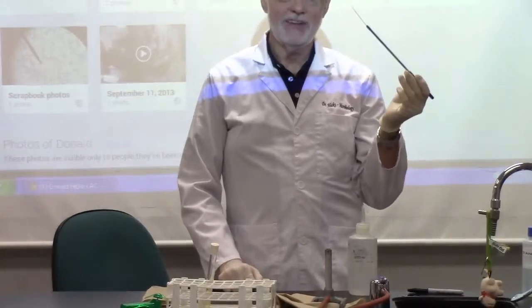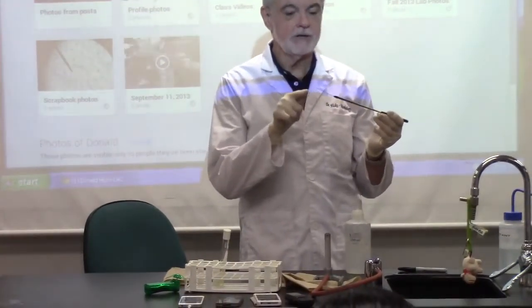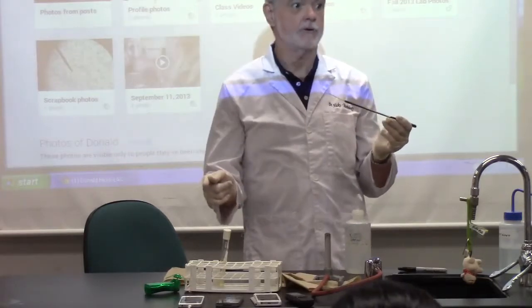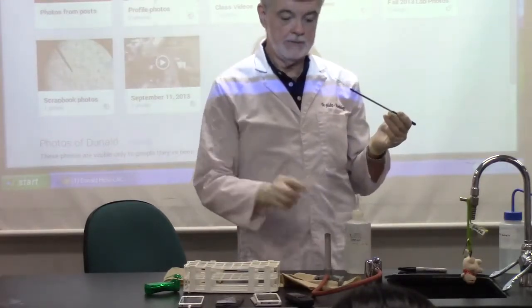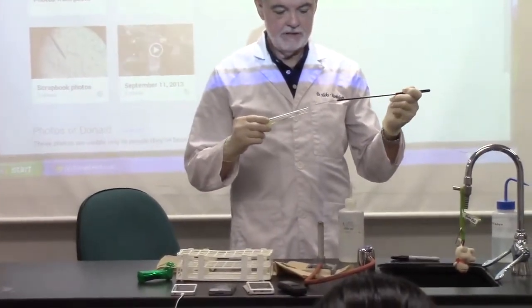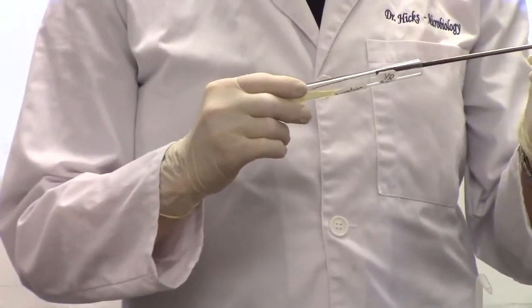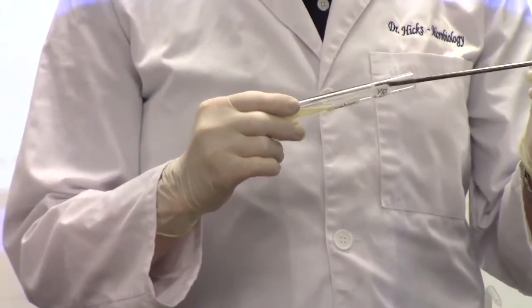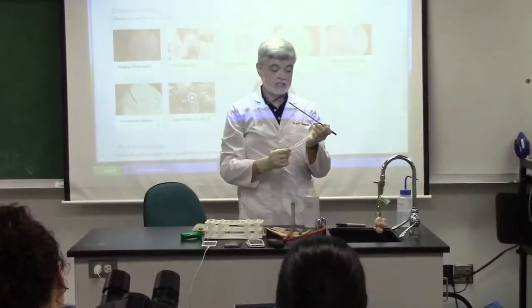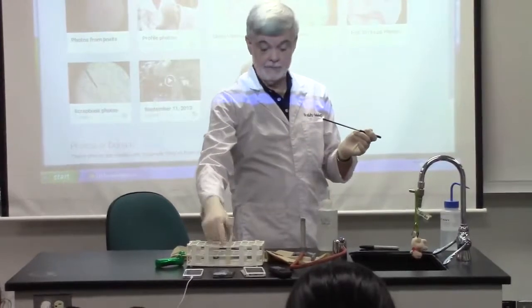Get a good habit so that every time you pick up a loop, you heat it to red hot and sterilize it before you use it and after. Every time you use it. This is bacillus, so I'm going to go past halfway, touch it down and brush a little bit of the cloudiness. Remember to hold it up like that so you can see where the stuff has been scooped off.